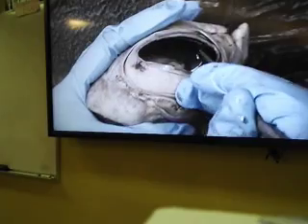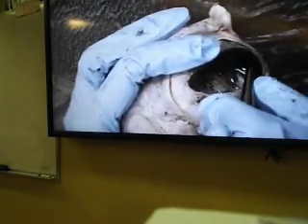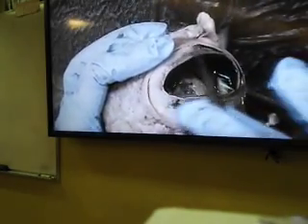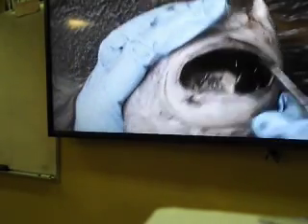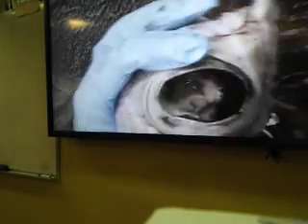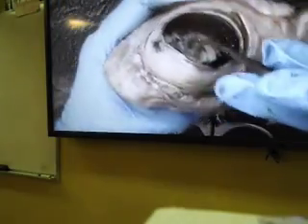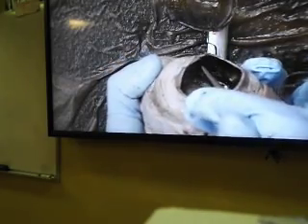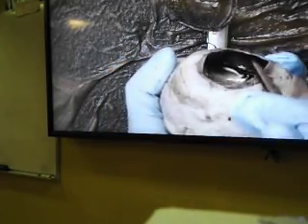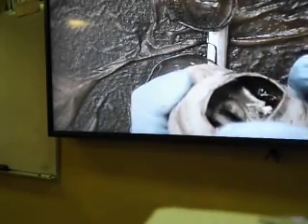directly underneath I see this black structure. And what am I doing right now? I'm separating this black structure from the back of the sclera. Don't forget, this is the sclera, so the back of the sclera all the way over here, and I am separating this blackish structure, which in this cow eyeball also has this bluish sheen from the sclera. So right now you see the back of the sclera, this is the choroid with the blue sheen, and the retina.